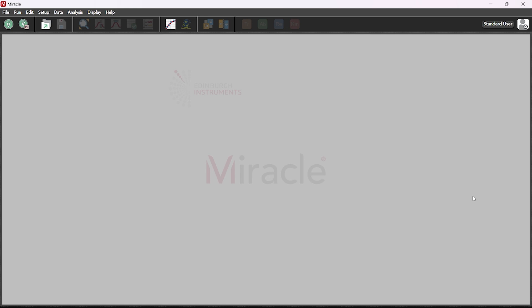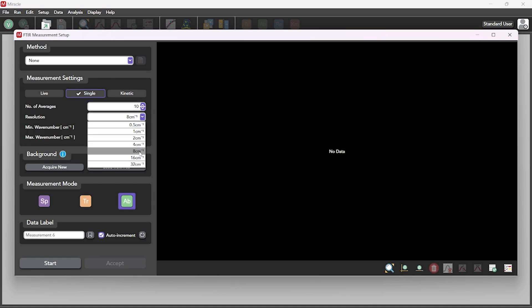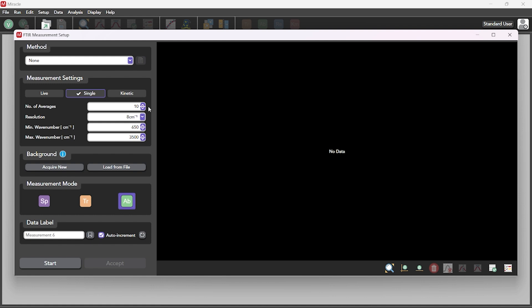To begin using the IR5, press the FTIR setup button at the top left of the screen. From this window, the resolution along with other analytical parameters such as the number of scans and the minimum and maximum wave number can be set.